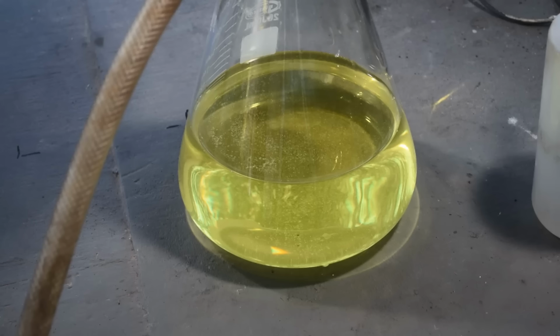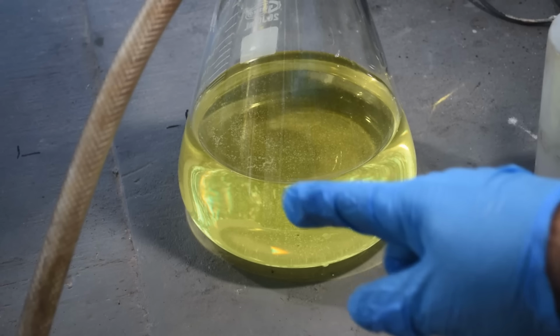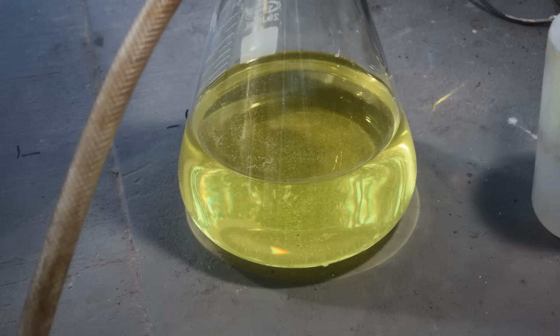I mean, certainly in future steps when I reprocess this gold, this lead chloride might go back into solution in hot aqua regia and just follow the gold through the whole process. So I don't want that. So I used sulfamic acid, which should have produced some sulfuric acid and dropped the lead out as lead sulfate. But apparently we didn't get rid of all of it, if that's lead chloride crystals like I think they are. So maybe I should have put some sulfuric acid in there too.